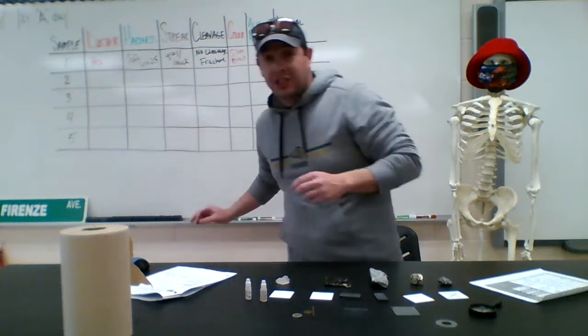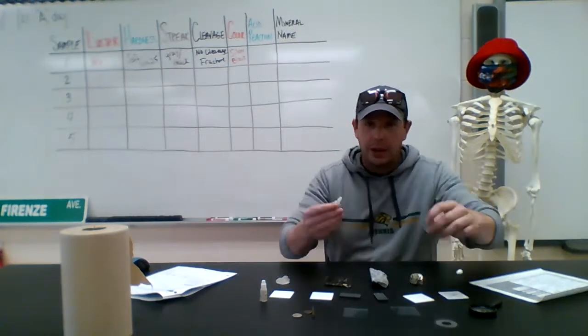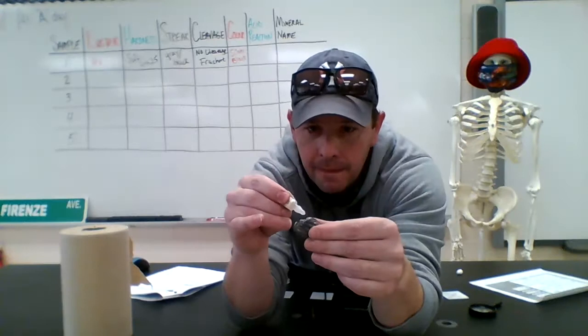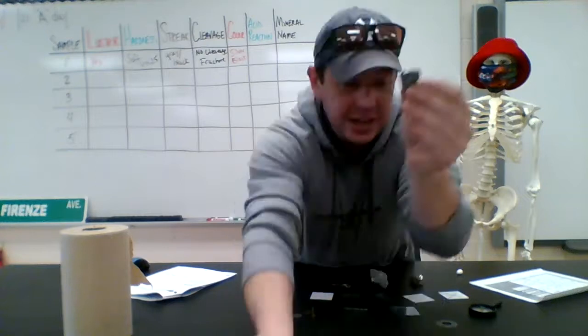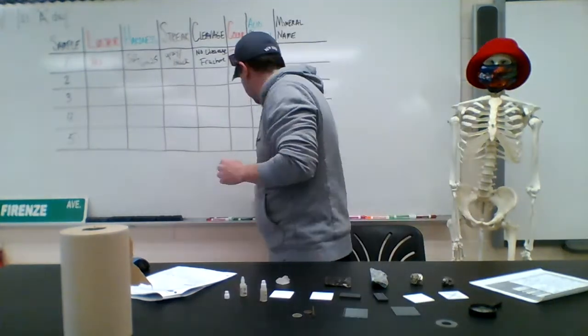Now the fun test. We get to test it for the reaction of acid. So I'm going to take a little bit of acid here. Okay, I'm going to take a drop of it. That's all we need. And I'm going to drop it right on here. All right, let's see here. If I get close enough to you. Oh, I hope I don't knock everything over. Here we go. Nothing. Not reacting at all. It just smells. So acid doesn't react. So that's a no. All right. So let me write down no here. No reaction to acid.